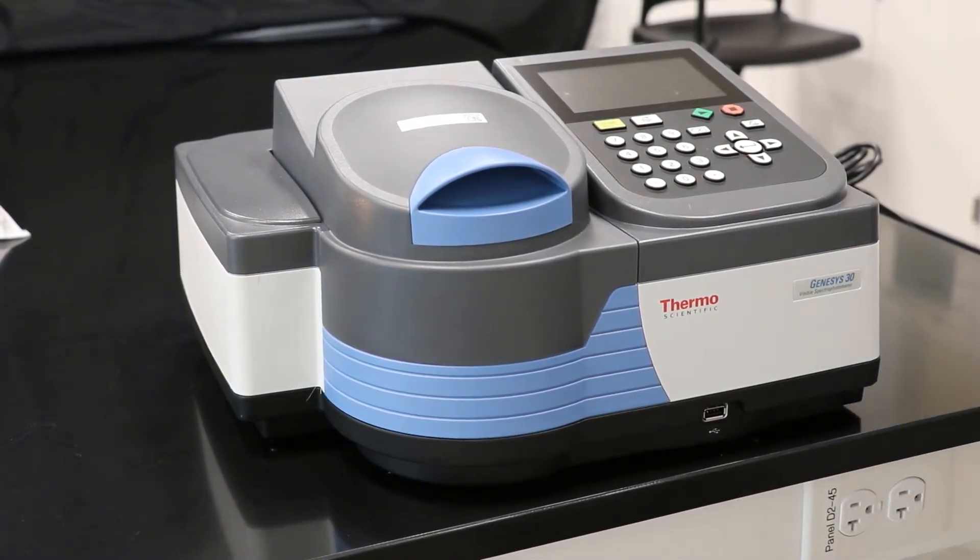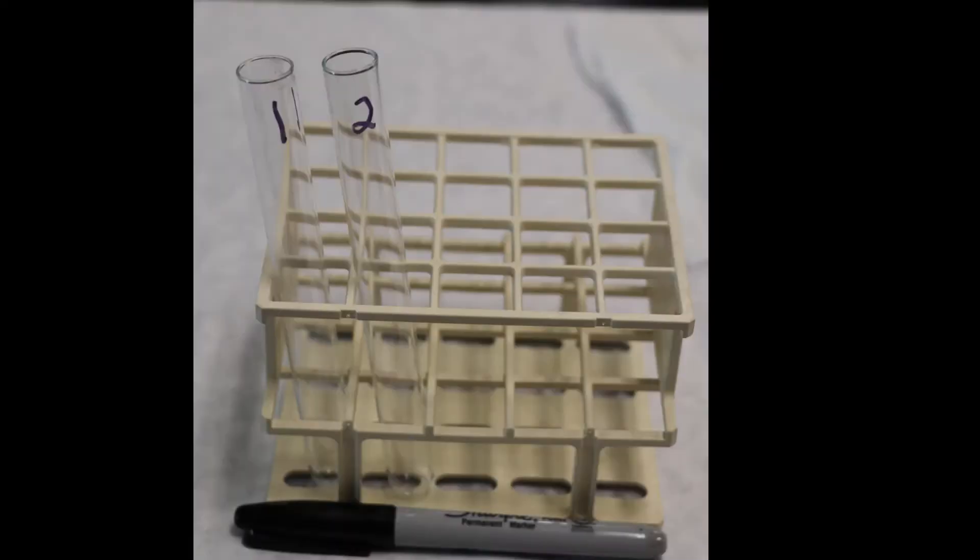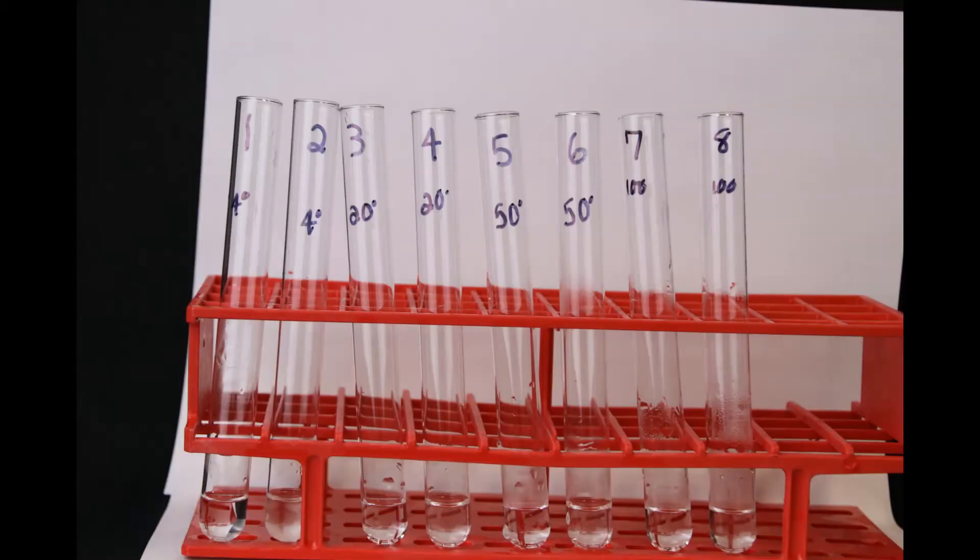Now we're going to see how temperature affects invertase enzyme activity. Obtain a test tube rack, two test tubes, and label them 1 and 2. In this video we will be doing all the temperature groups, so we will label the tubes 1 through 8 to prevent confusion. But when you are in the lab you will probably be divided into groups to perform your assigned temperature.